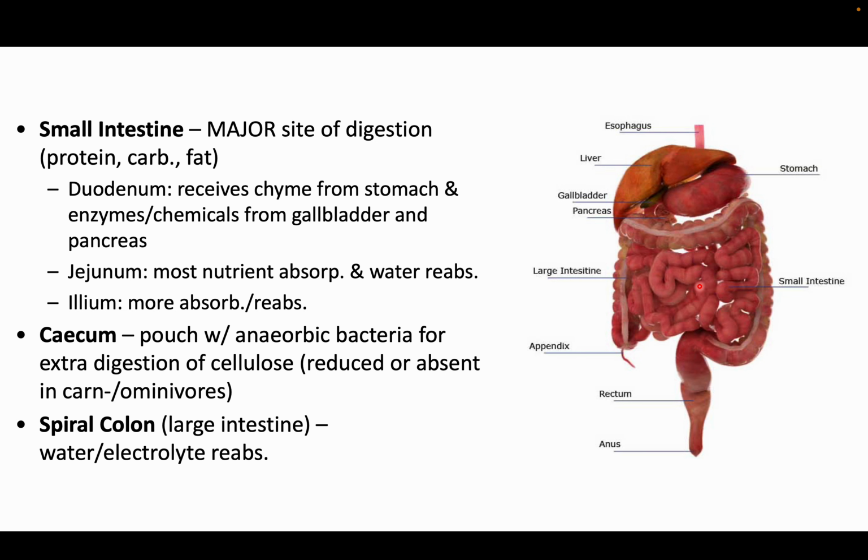And it's going to be used as the fuel for energy, especially the monosaccharides, which is the glucose that's broken down from carbohydrates. So, between the small intestine and the large intestine, in pigs, you're going to find this very large cecum. In humans, we have a small cecal pouch, but technically, we have an extension of that, which is called the appendix. As of right now, there's no really known function of the appendix, but in pigs, they have an actual true cecum.